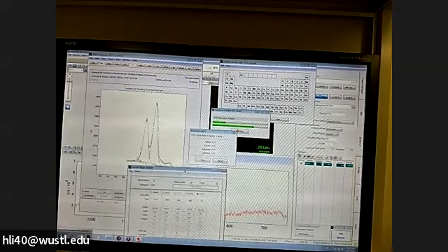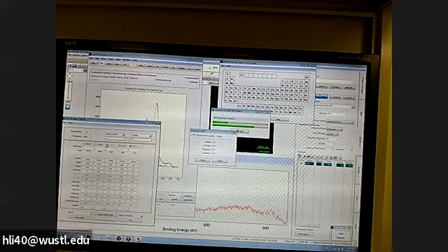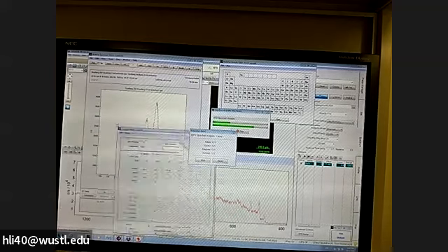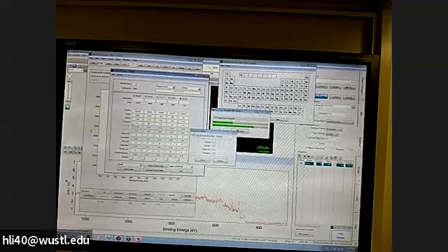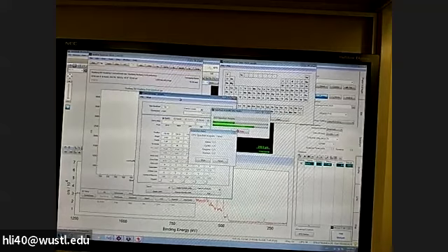The band 3. Oh, where's the band 3? We can click band 3, which is there. Band 4, there, 5. That's the 100% goals from those two. So the first fit is not very good, but it's okay.